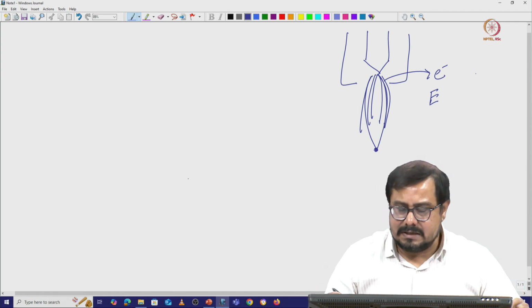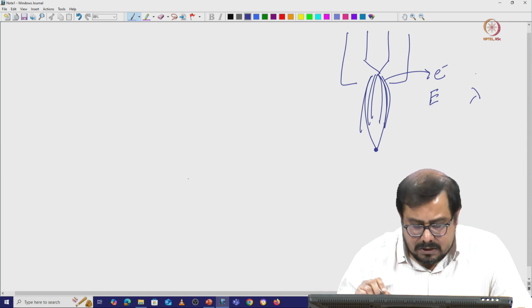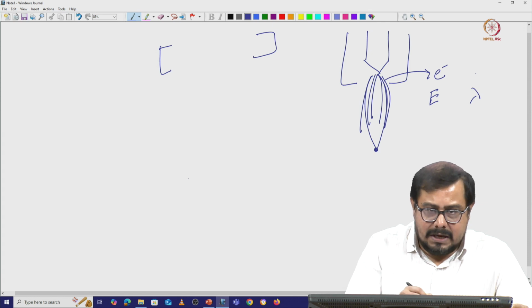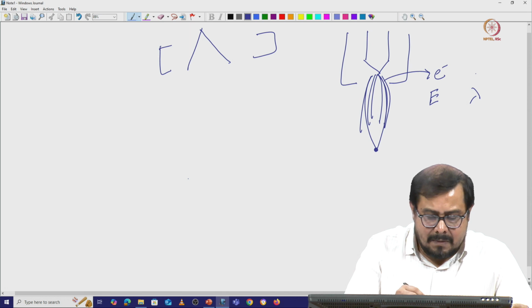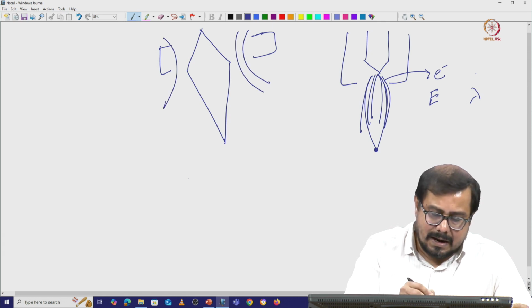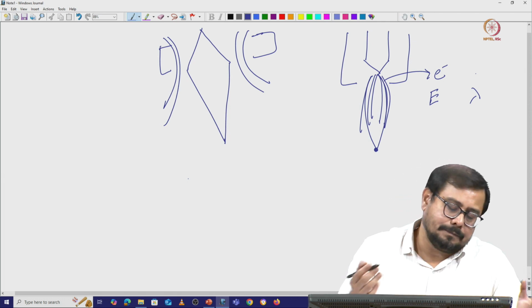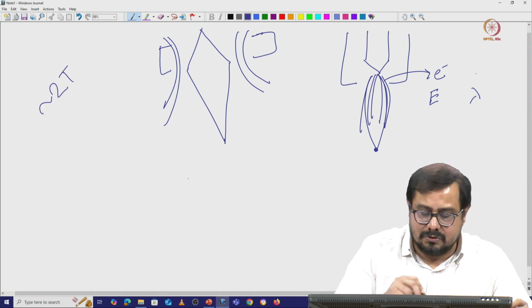But if there is an energy difference, it is going to affect the wavelength also, right? And we are always considering, when we have an electromagnetic lens system with an electron beam, that we are just using a ray diagram and we consider that all the rays converge at one particular point, and at one particular time we are using the same magnetic field. So with the same magnetic field, for the objective lens, as I told you, it is around 2 Tesla. We are using this magnetic field.